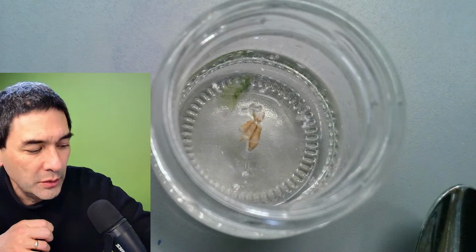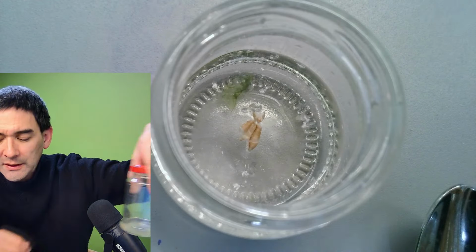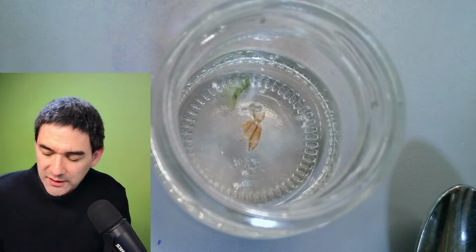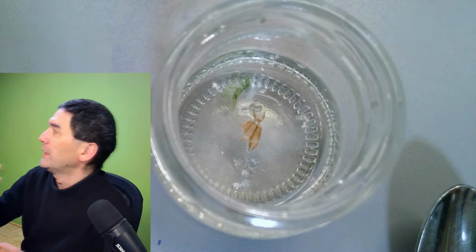I just want to show you this one. You also know it from a previous one. Here I did not use the whole grains, but I used the following. Just a second.